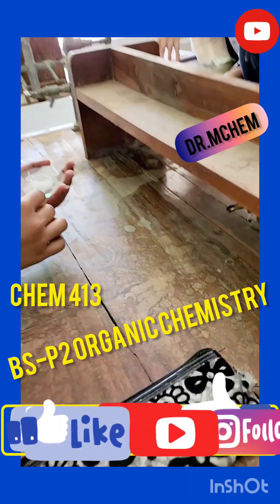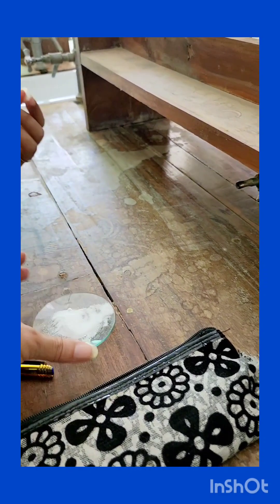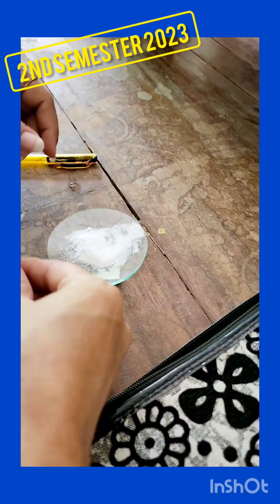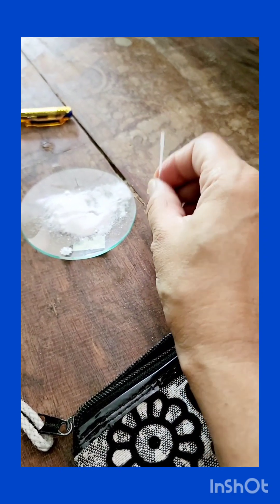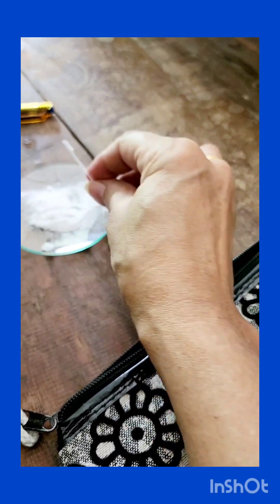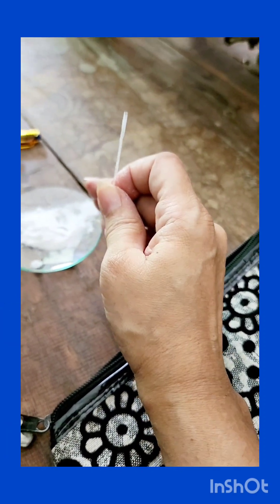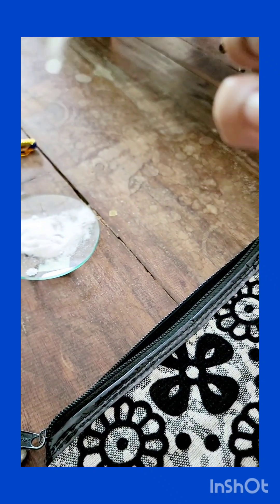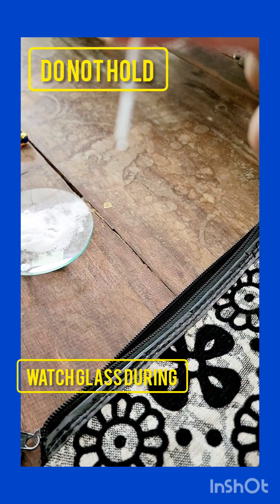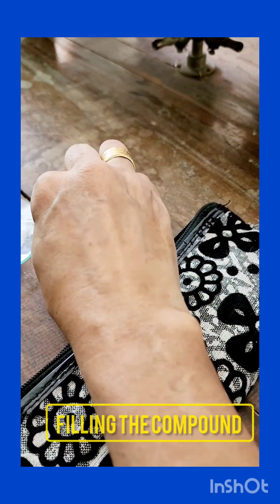The students are filling up the compound. Don't do it like that — put it over here on the flat table, and then tap it, fill it again, tap it again, fill it again, tap it. You will never hold the watch glass in your hand. Am I clear? You can see easily, right?